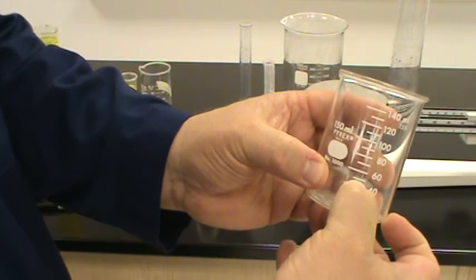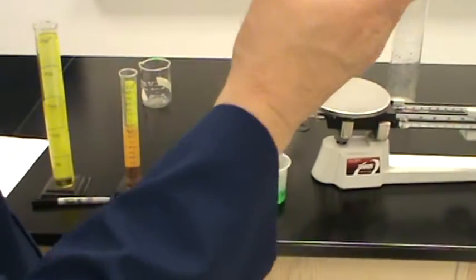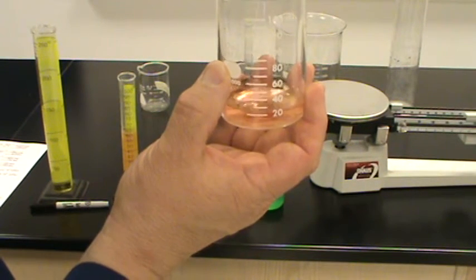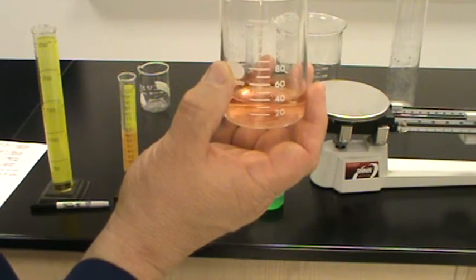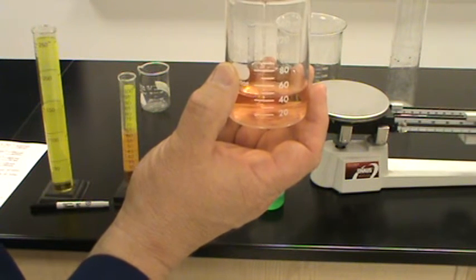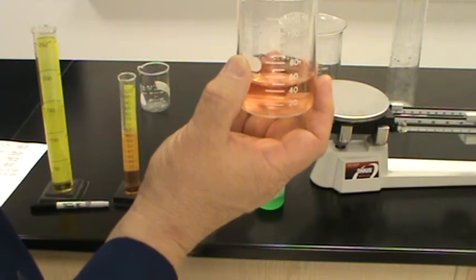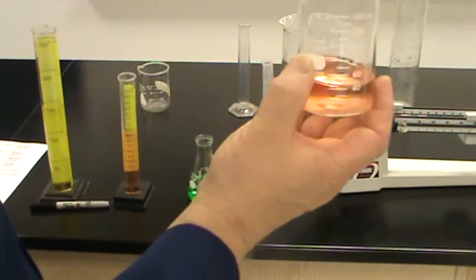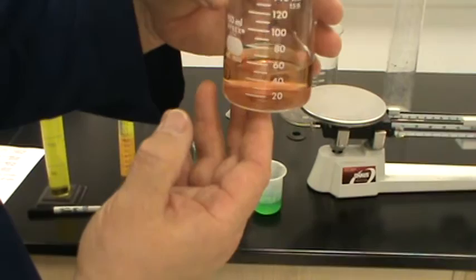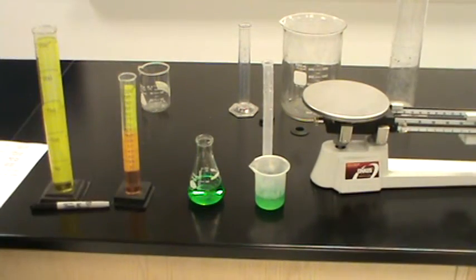50 is going to be right there above my thumb. So let's see if I can get 50 milliliters into this container. We're going to run it up. There it goes past 40. And we're watching the line. Sure enough, I want it just to the top of the white line because that makes up for the concave shape of the liquid. And sure enough, I'm right there at 50 milliliters. So I have done that correctly.